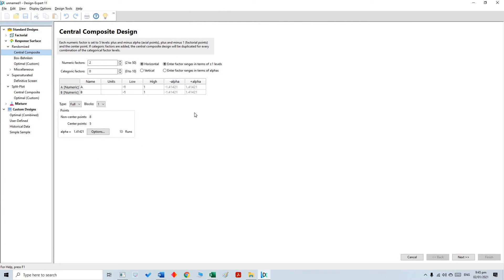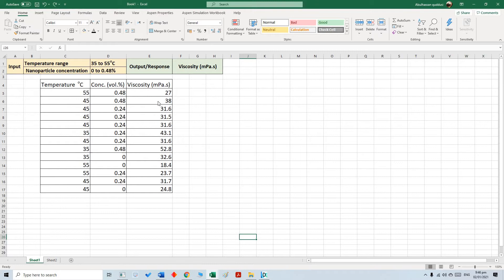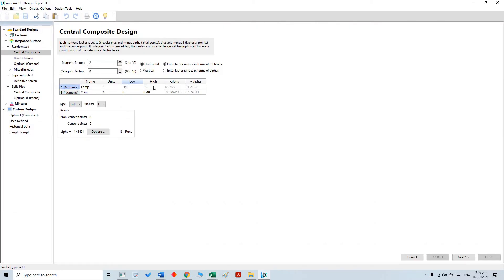Let's start. I am going to select the central composite design. As mentioned, we have two input parameters. The first parameter is temperature — I am going to use some abbreviations — and then concentration. Temperature is denoted C while concentration is in percentage. The temperature range is 35 to 55, and nanoparticle concentration is 0 to 0.48.